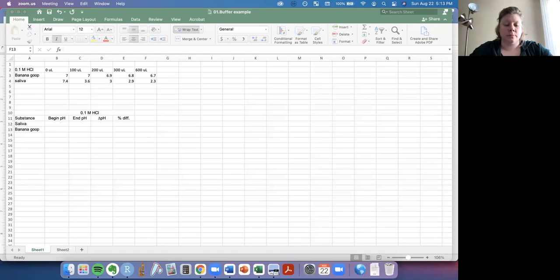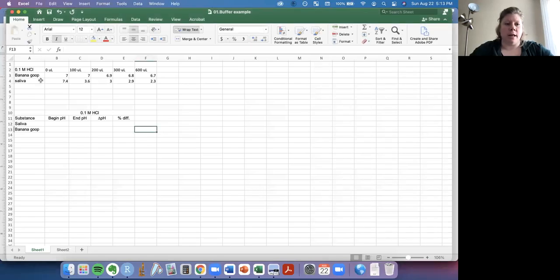Hi scientists. Today we're going to walk really quickly through making a graph in Excel, specifically to look at the buffer data we're going to be collecting in lab one. So I'm going to share my screen here and go to Excel.